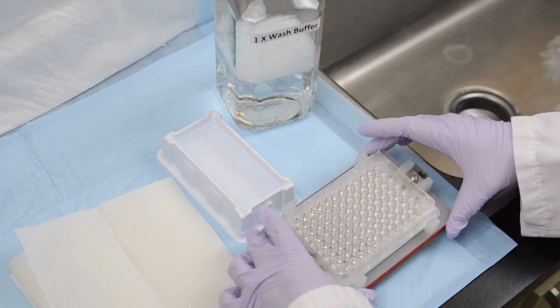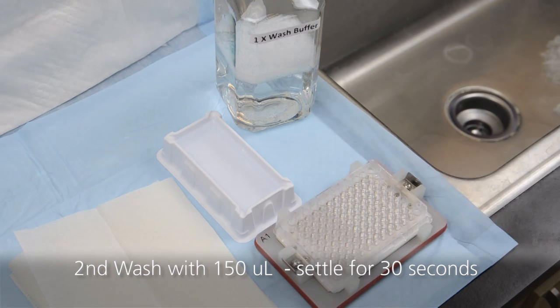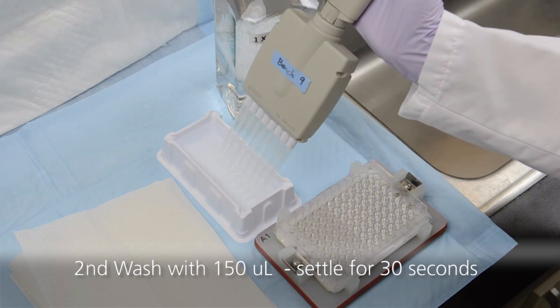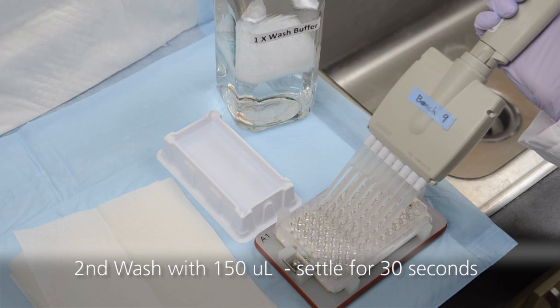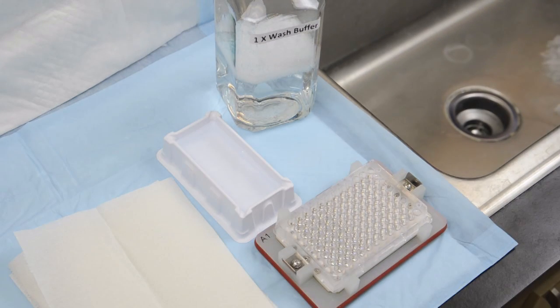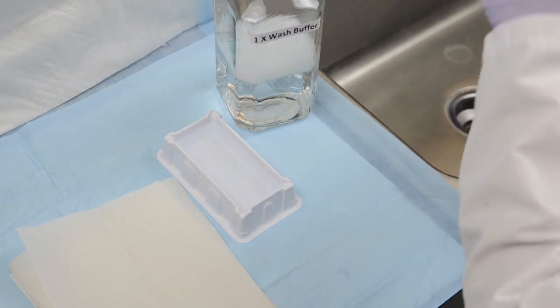Take the handheld magnet and plate assembly and quickly invert the contents into the sink. Wash the plate a second time by pipetting 150 microliters of wash buffer into each well and allow the beads to settle to the bottom of the plate for 30 seconds. Take the assembly and quickly invert the contents into the sink.